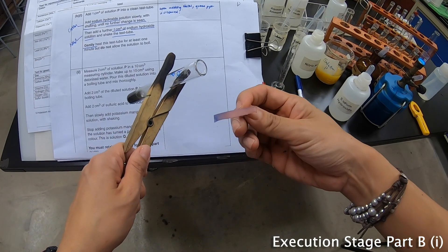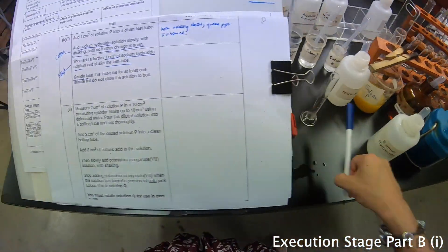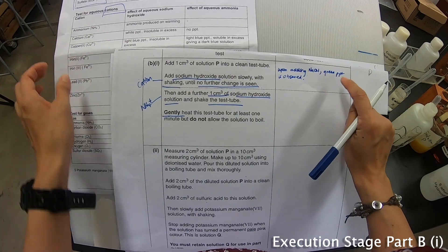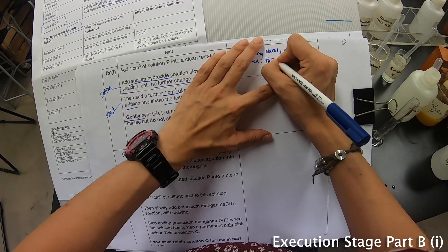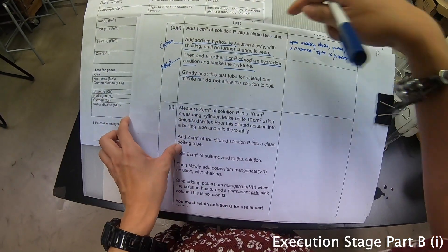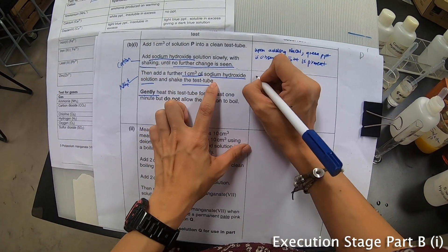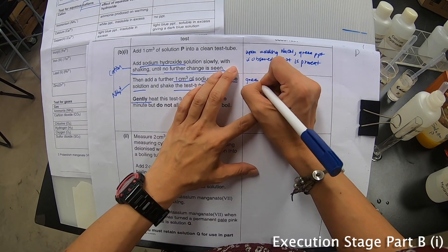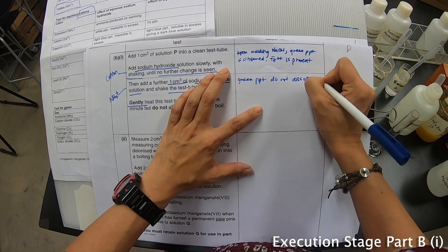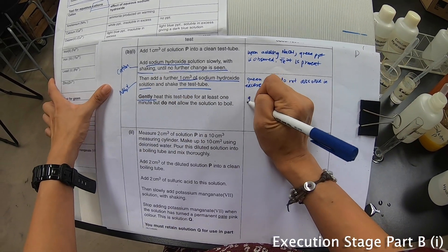The whole thing becomes really, really blue in colour. So I'll stop the Bunsen burner. Now when there's a green precipitate observed I can immediately conclude that Fe²⁺ is present. And to remind myself of what I'm testing — green precipitate does not dissolve in excess. Upon gently heating the mixture, gas evolves.